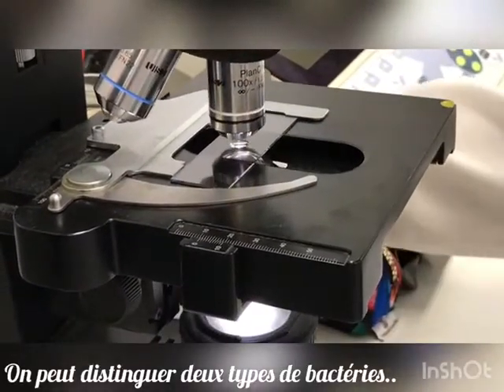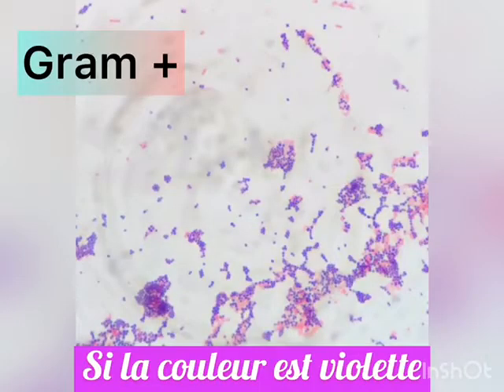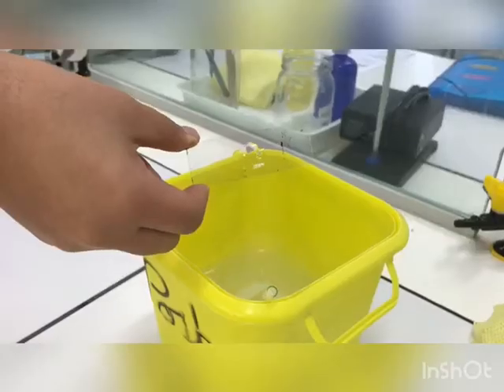We can distinguish two types of bacteria. Those which have a thick layer of cell wall: the Gram stain colors these bacteria purple, and we call them Gram-positive bacteria. Those which have a thin layer of cell wall: the Gram stain colors them pink, and we call this type Gram-negative bacteria.